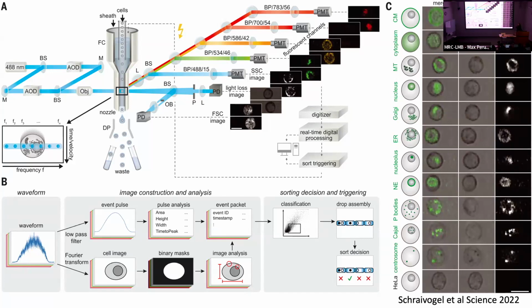You can't, at least not yet, though I think it's coming very, very soon. You also cannot use 2 dyes on the imaging component that would overlap, because there's currently no way of spectrally unmixing them. That's coming very quickly, and that will change very quickly.